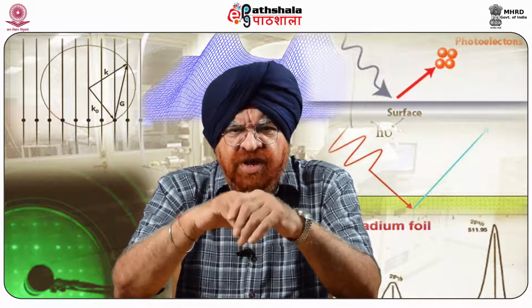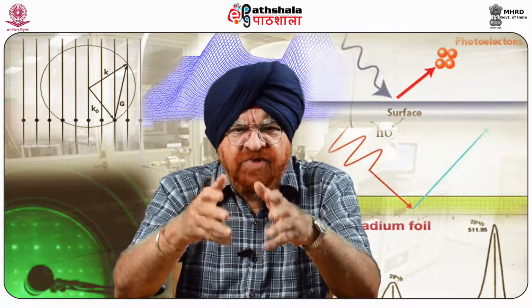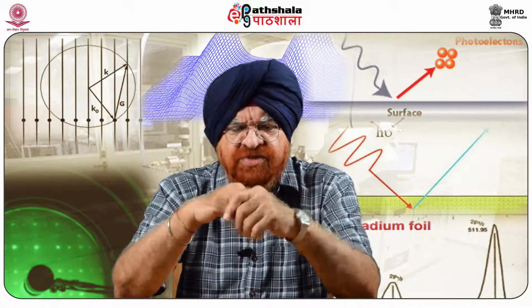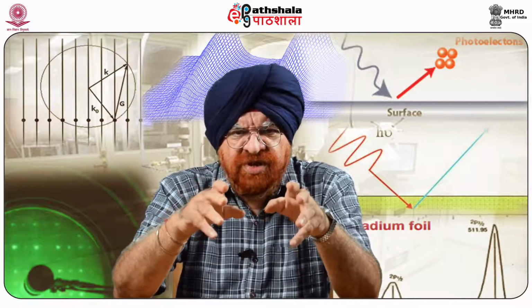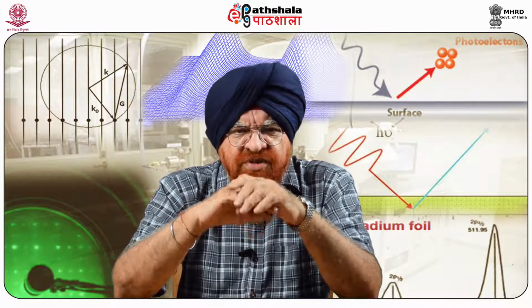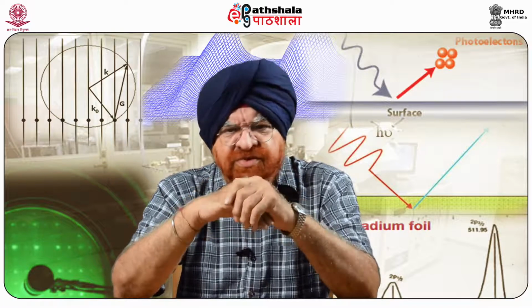Well, the advantage gained from the use of conducting metal coatings and replicas does not come without some drawbacks. That means there are some problems which one faces while using this equipment. However, we must remember that with these techniques, the STM creates images of the metal coating and not of the original biological material. Thus, the resolution is limited by the nature of the coating procedure and the topography of the grain in the metal surfaces.